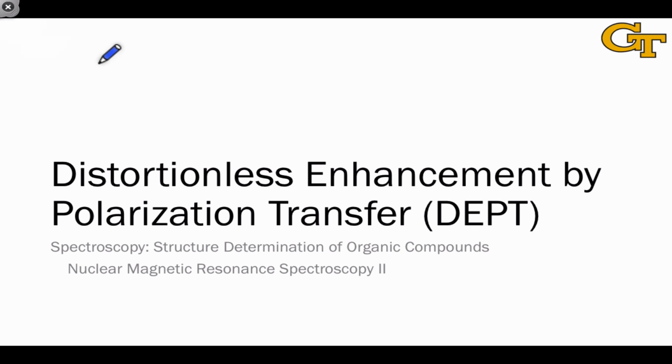The limitations of carbon-13 NMR that we've discussed make it clear that you can get very little connectivity information out of a pure carbon-13 NMR spectrum. Because of this, a few different techniques have come up to give us more information from carbon-13 NMR, and the most important and useful of these is called distortionless enhancement by polarization transfer, or DEPT.